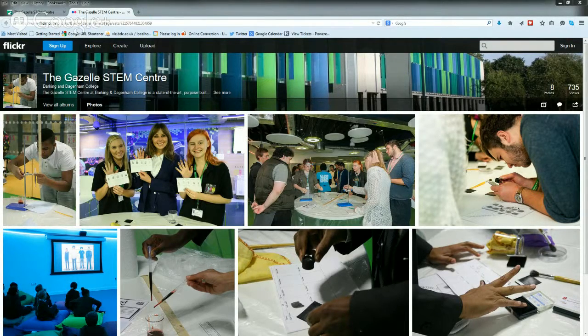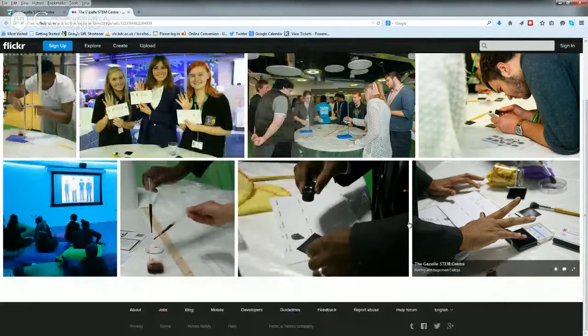At the next picture along, you can see them taking the blood out of the beaker, ready for testing. On the other side, where you said before with the finger, where he's putting the finger in, they're then doing fingerprinting. So they're checking their fingerprints. The picture above that is then checking the fingerprints. So this is where the person is actually checking fingerprints. So they'll be taking fingerprints. There'll be fingerprints at the scene, so they'll be checking that as well.